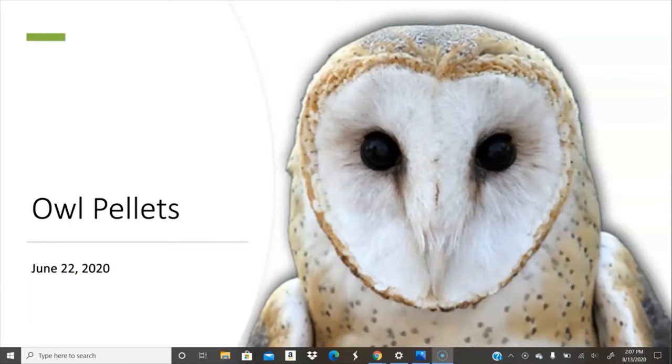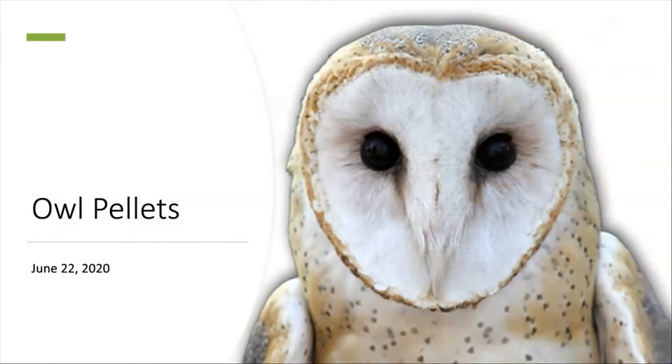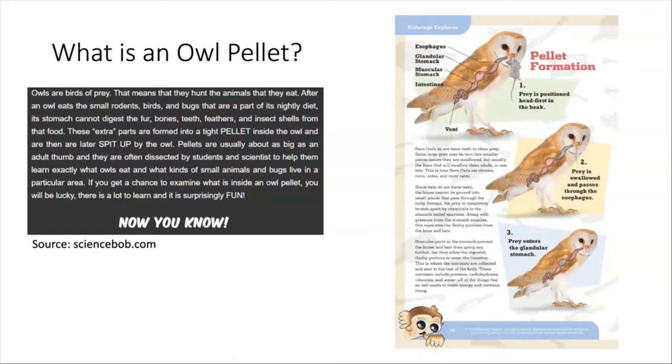Those are the kind of owls that produce the owl pellets we'll be dissecting today. So what is an owl pellet? Owls are birds of prey, which means they hunt for small animals, but they actually cannot digest the animals' bones, meaning that they spit them up later in this owl pellet, which is all condensed fur and bones and anything that the owl cannot digest from their prey.